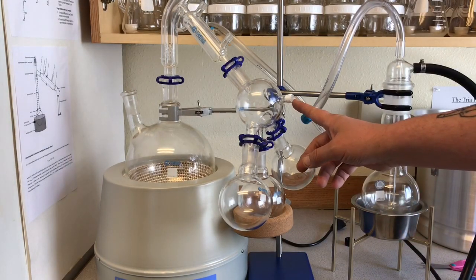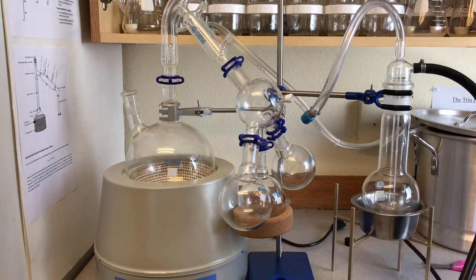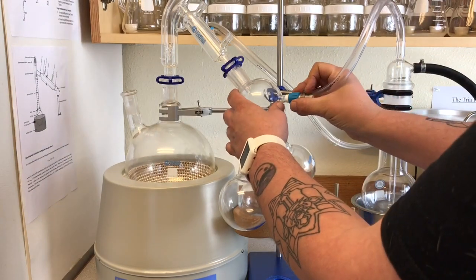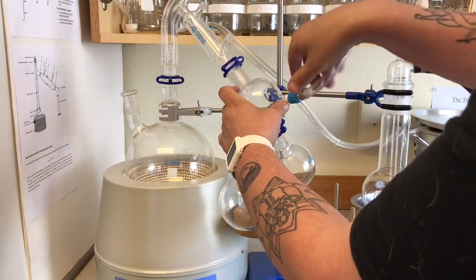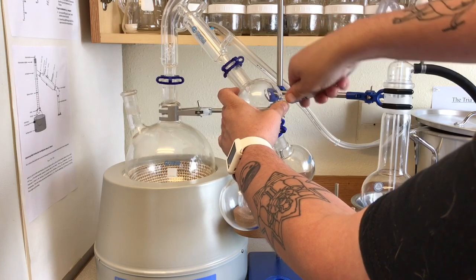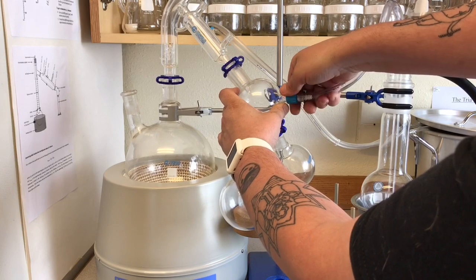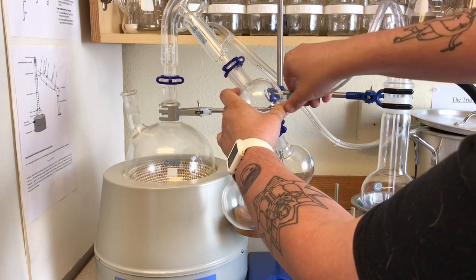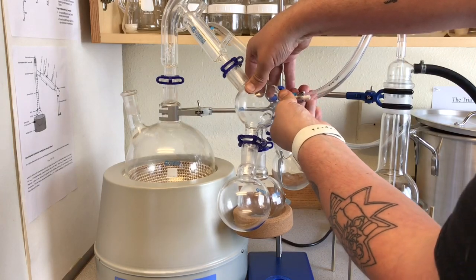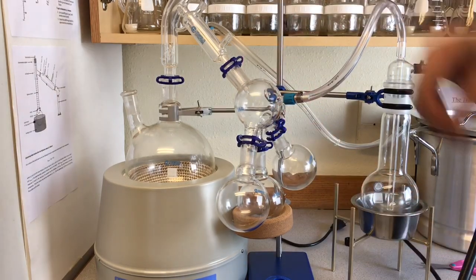So I wrap this connection here with my Teflon tape. When you're using the Teflon tape, you want to wrap it in the opposite direction that the threads go. So now that I've got my Teflon tape on here, I want to very carefully take my vacuum line, and we're going to tighten this guy up as tight as we can without cross-threading it or without damaging that. Okay. And once you've got it tight, you want to give it just a little eighth of a turn to seal that.